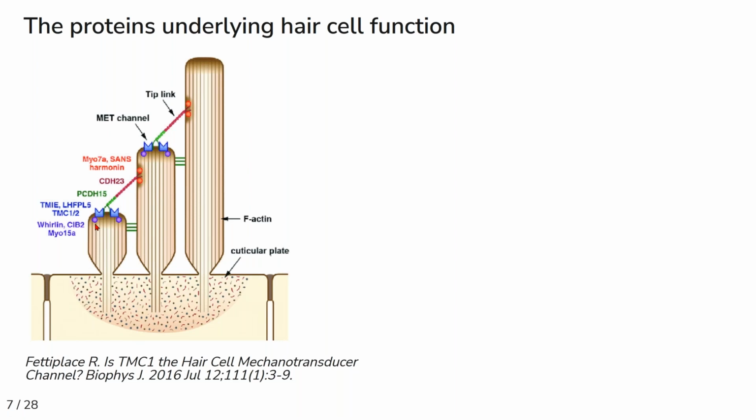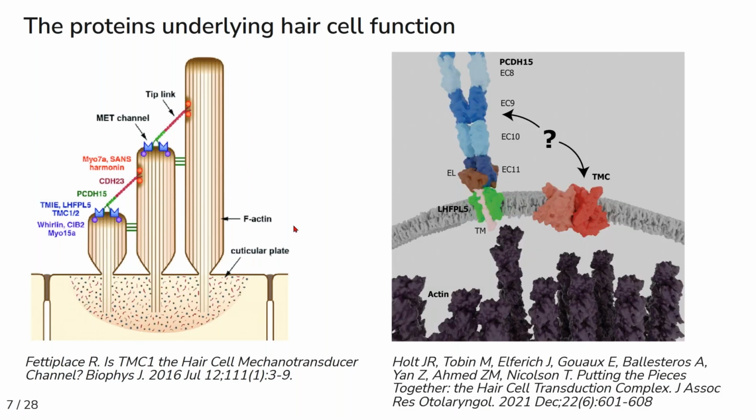But we as structural biologists, of course, want to go further than this kind of cartoon view of the machinery and actually create atomic detail models of the machinery to really understand how that transduction works. And so this is a rendering that I created for a recent review that kind of summarizes the current state of structural biology for this complex. And it's actually not that much.